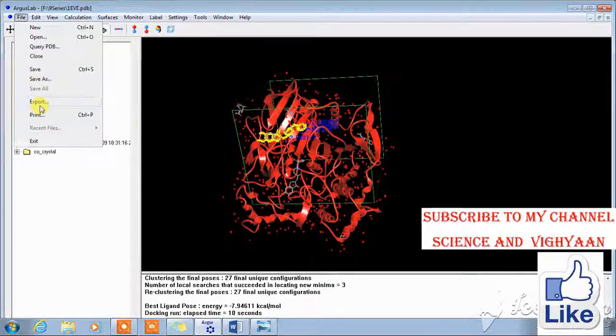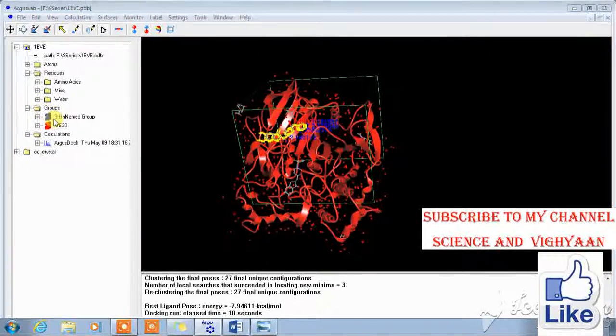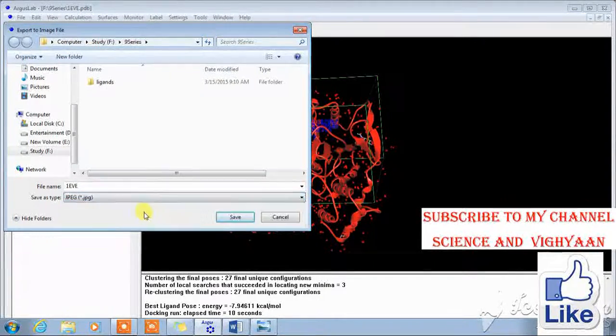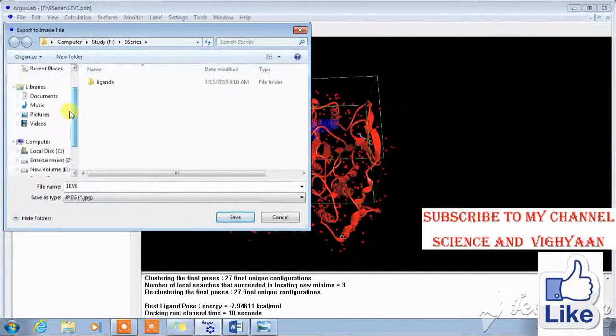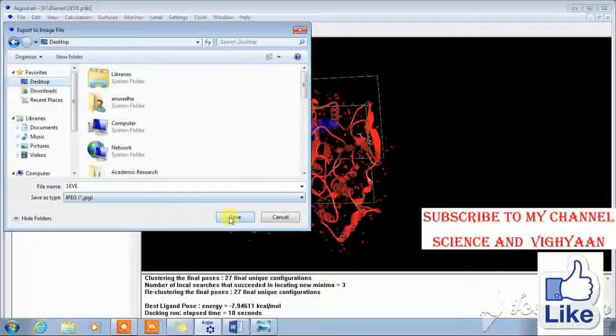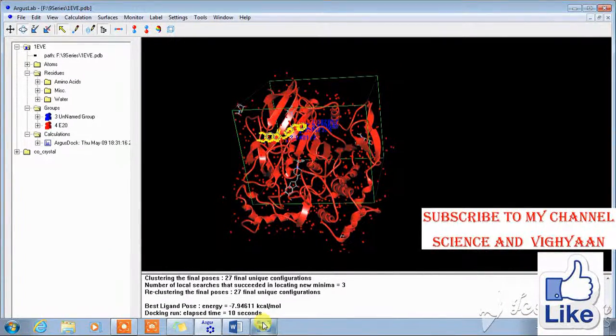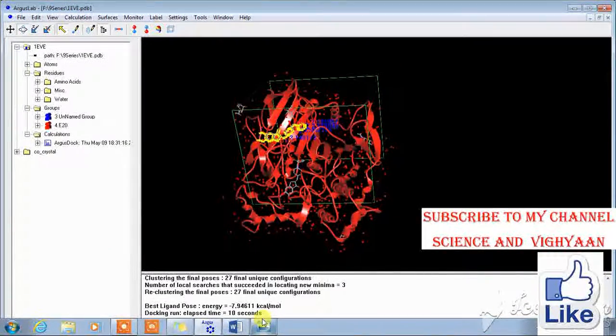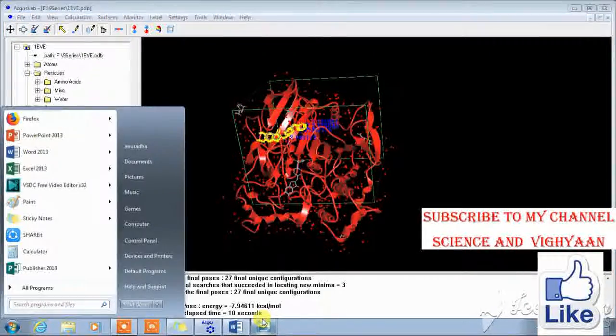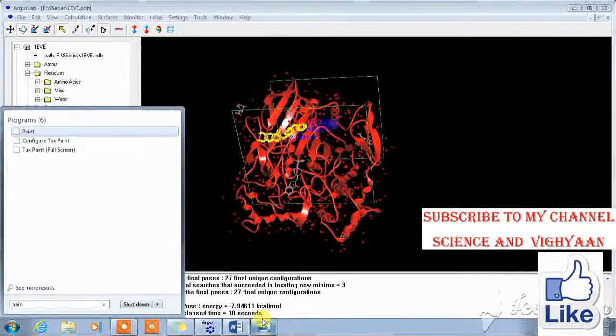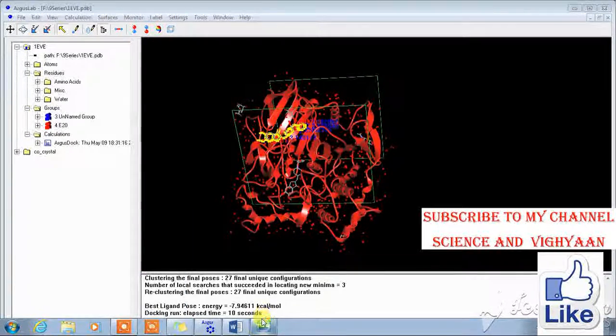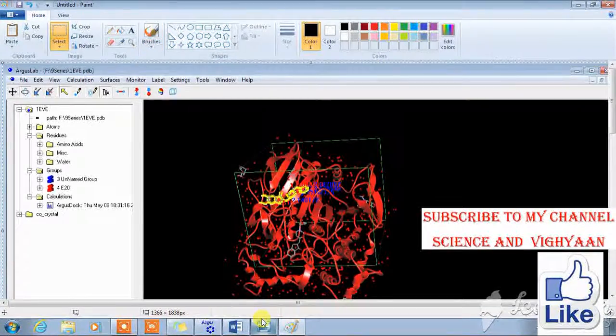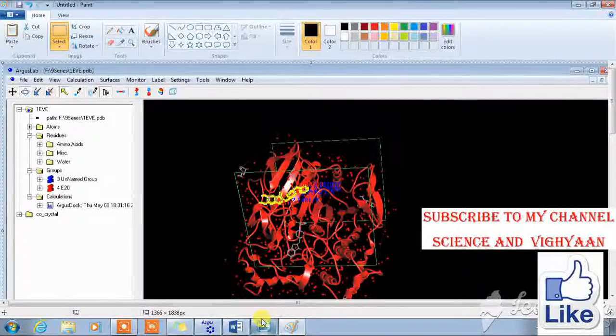Export. Export by taking its picture, like on the desktop, save. Or otherwise you can do the print screen function and print screen and paste it in the paint. Save here. In this way you can take the poses.